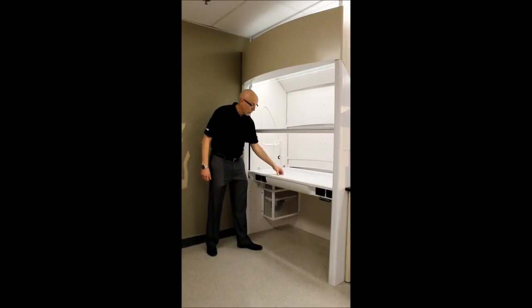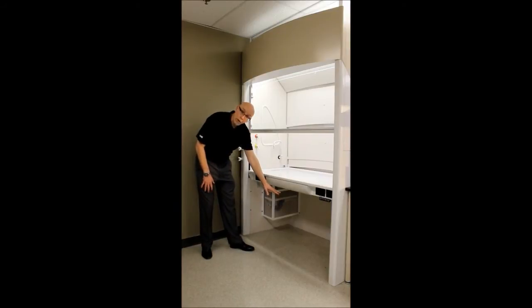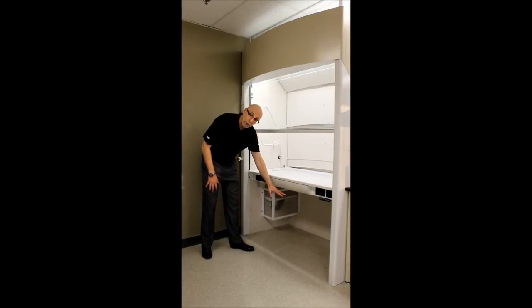Beyond being a flush sill, this also opens up and there is containment in here. If there were to be a spill within the fume hood, it would go out into this containment trough. Underneath the fume hood you can put storage cabinets — whether a standard storage cabinet, acid, solvent, or whatever is required.